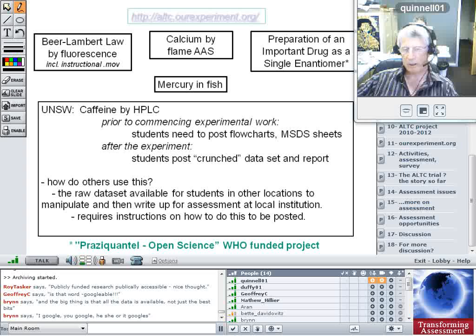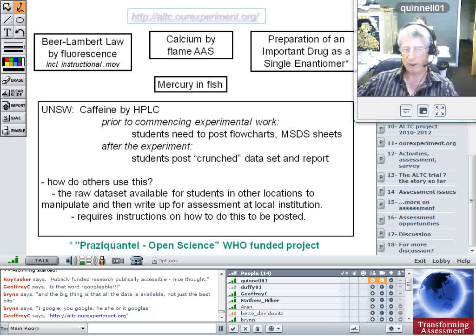The approach with the ELN is that we will get the students to post their risk assessment, and then the member of staff responsible for that experiment will go in and comment on it, and the electronic signature essentially will be accepted as the hard copy signature.